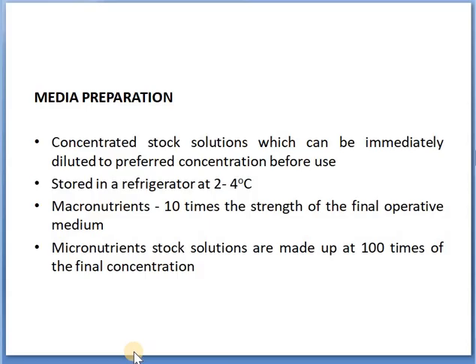Weighing all the numerous components in a tissue culture media generally will consume a lot of time and effort. Also, many of these components are required in very minute or even trace quantities. Weighing such small quantities of substances becomes very difficult, so accuracy cannot be maintained. To overcome these difficulties, generally concentrated stock solutions of tissue culture media components are prepared and stored.